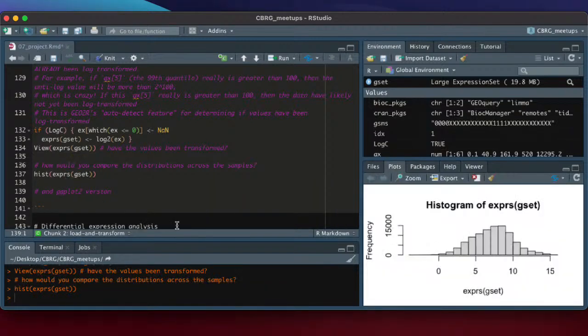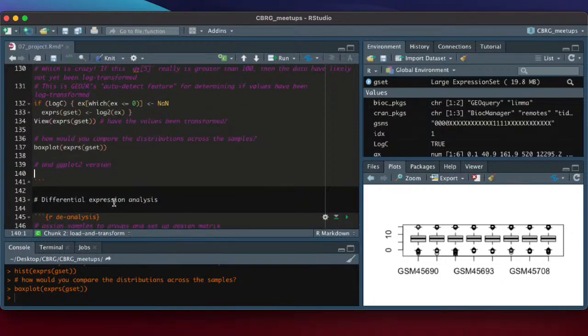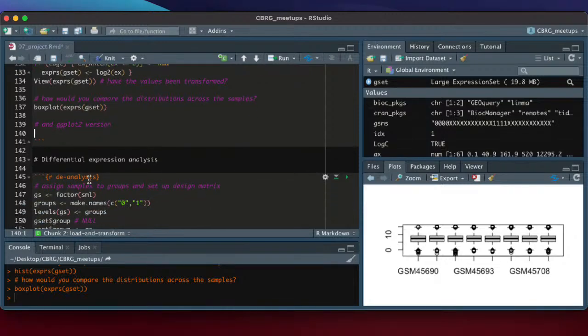This might or might not work, but unfortunately, this is giving you a histogram of all the values. So if we instead do boxplot, and I don't have a good explanation for why boxplot doesn't do it, boxplot gives you the distributions for each sample. That's interesting. I don't know why there's this divergent behavior. It doesn't just give you one giant boxplot. It's clever enough to know that you want the boxplots for the different samples. Who knows? So that's one quick way, and as homework, try to do it with ggplot. It's a little bit unfair because there's one step that we haven't covered, but we can maybe cover it at the end if there's a little bit of time, or next week.